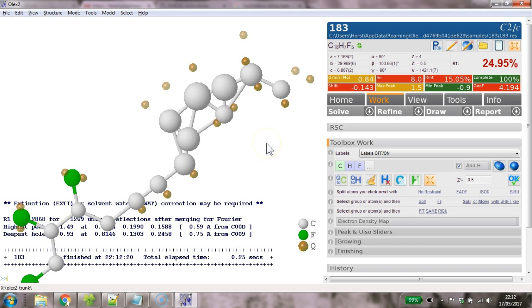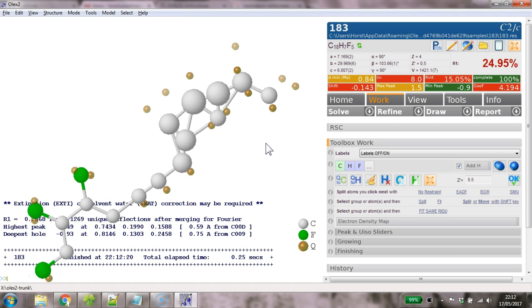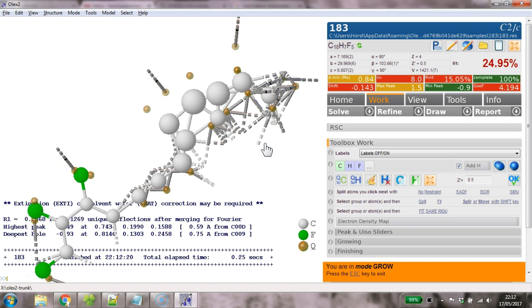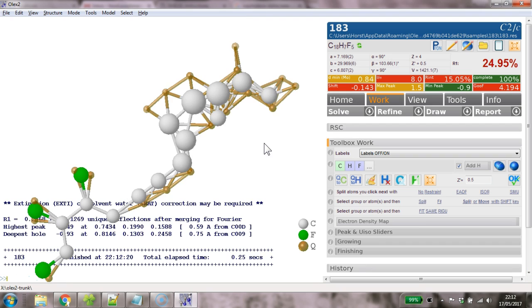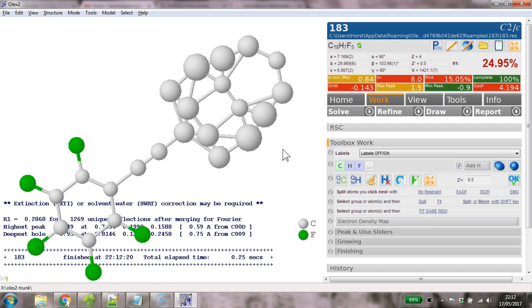So what's happening here is a bit of a mess. If I grow this, we can see that it's the Q-peaks, so I'm going to switch the Q-peaks off, control Q a couple of times and grow, right.